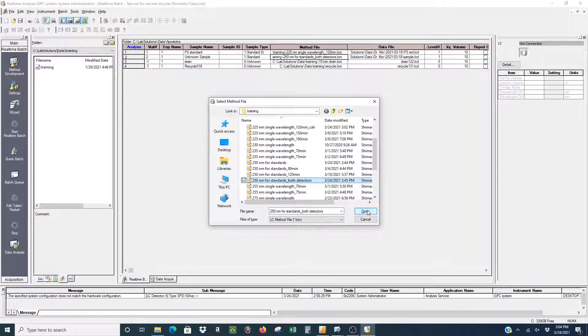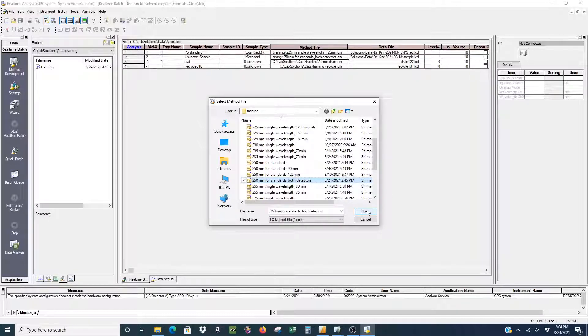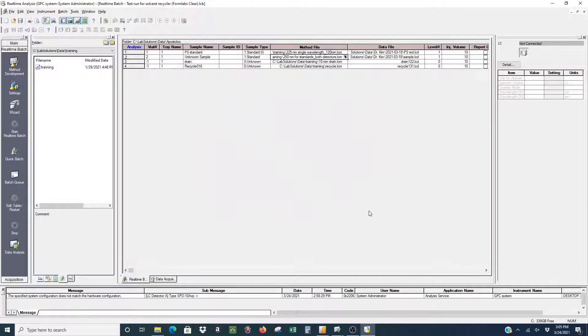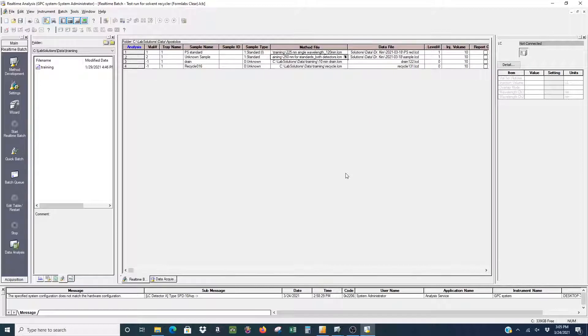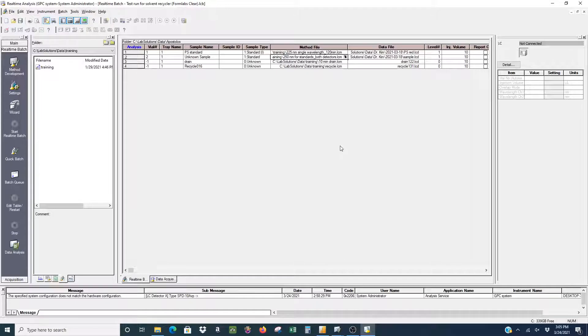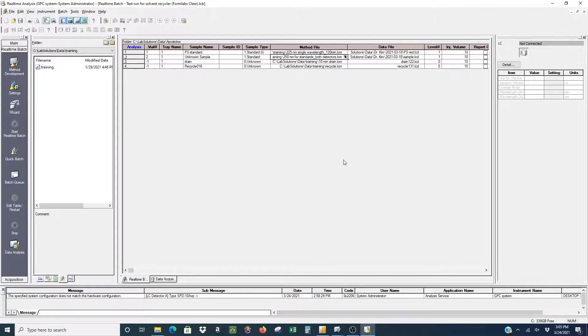Then the last thing you want to do is make sure you select the correct method file for both the standard and the unknown sample that you edited at the beginning. As long as you have done that, you can select all of your files that you want to run on the GPC and hit on the left hand side, start real-time batch and just go ahead and start your GPC run.